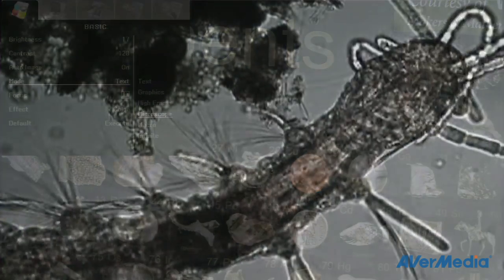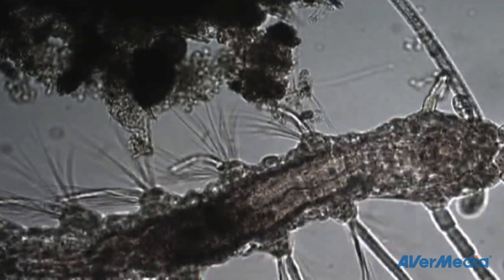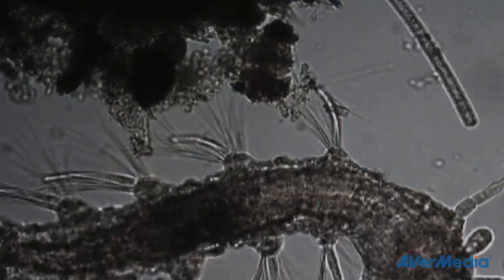You should now see your microscopic image on your large screen. Once the 355AF is attached, you can use all the same functions with your microscope including zoom, pan, image capture, and more.